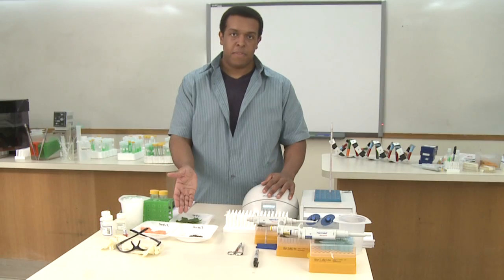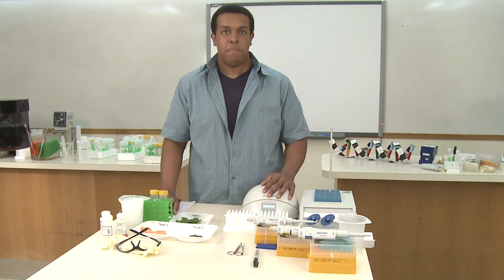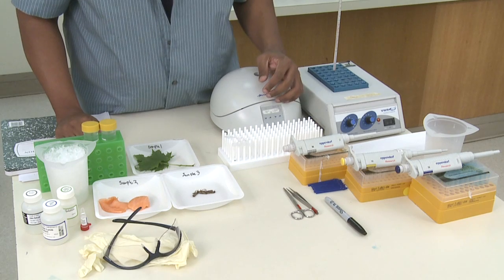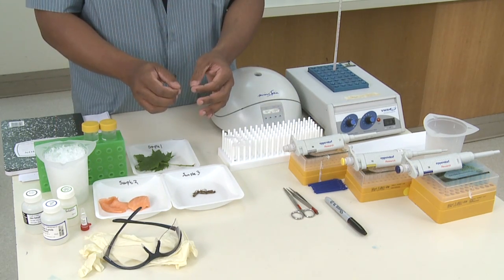We're going to take the samples that we've prepared earlier and extract the DNA. In order to do this, you'll need the following pieces of equipment. First, you'll need pestles, which we'll grind the samples with, scissors, and forceps, which you can use in order to actually get a smaller piece of that sample.